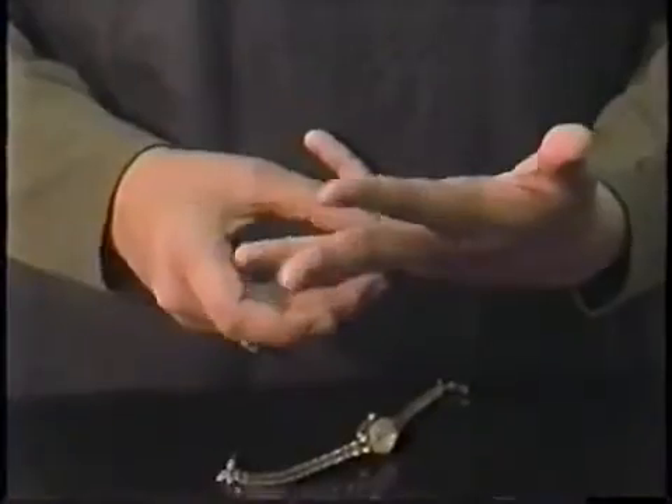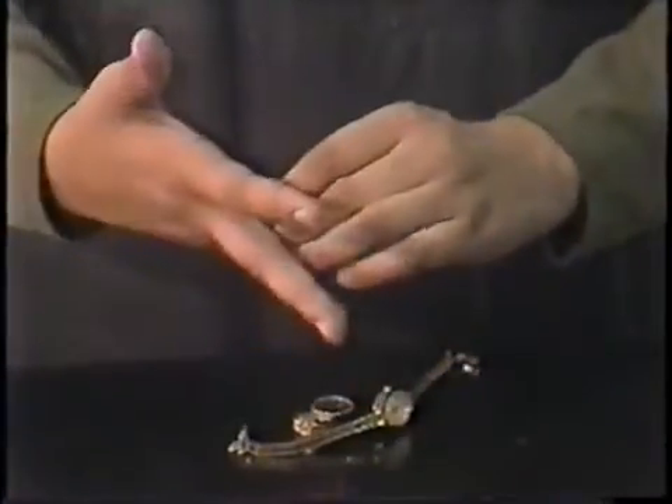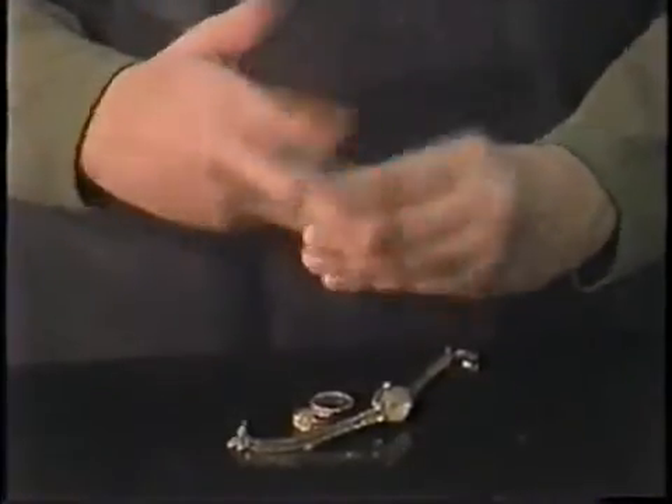Besides wearing the right clothes, there are other precautions you should take to avoid accidents. Tie up loose long hair — it could knock something over or even catch fire. Remove rings and watches, as they can trap corrosive chemicals against your skin, and the chemicals can damage your jewelry. Your eyes are the easiest to hurt and the most important to protect.